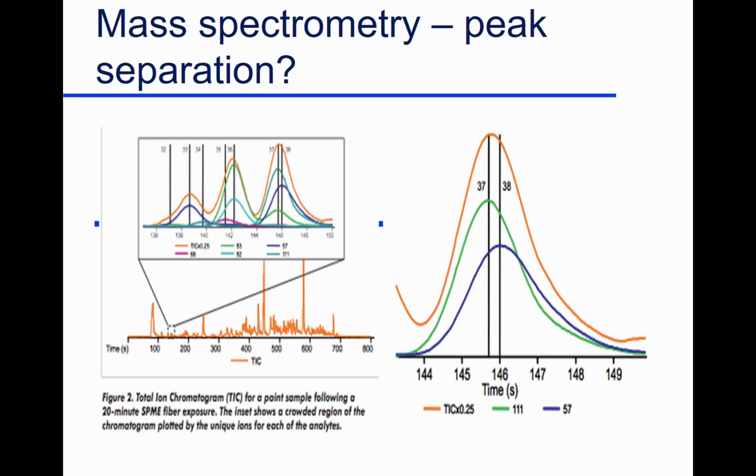And what the mass spectrometer does is it takes each of your compounds as they come out of your gas chromatograph, and hits them with 70 electron volt electrons. It's a tremendous amount of energy, and it blows those compounds to bits. But every compound will fragment a little differently. The pieces you get for each compound tend to be unique. So every compound, like I say, has a unique bunch of pieces. And then we start looking at those pieces.